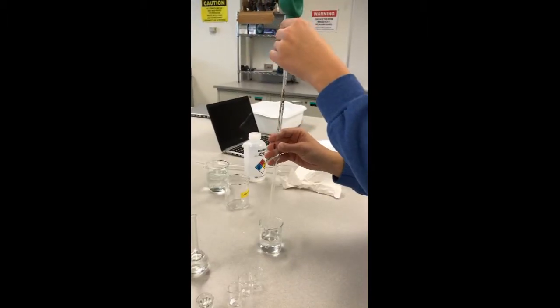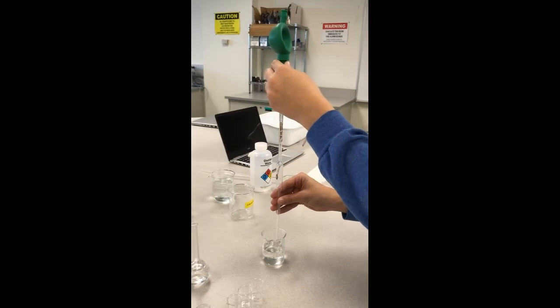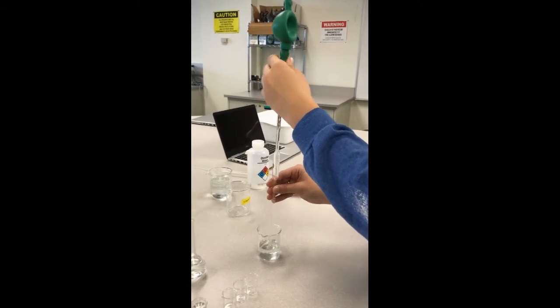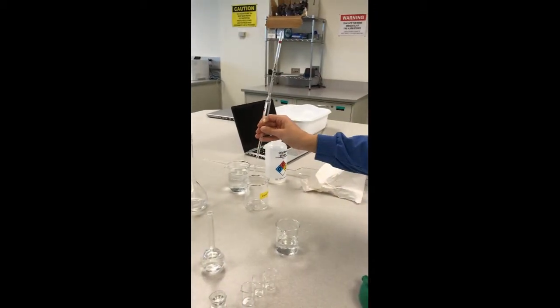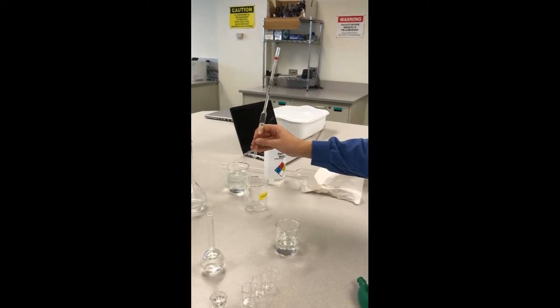So we're going to clean out the inside of the volumetric pipette with DI water by doing the same process we did to get water out of the volumetric flask, except it doesn't need to be exactly to the line because this is just to clean it. And we're going to dispose of the DI water used to clean it in our liquid waste beaker.